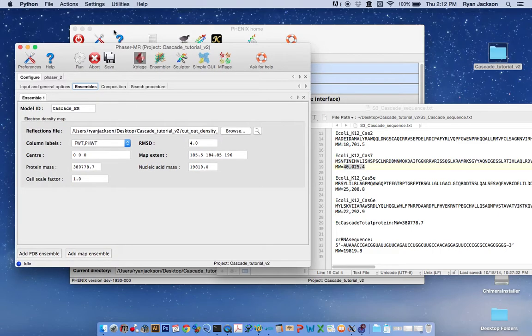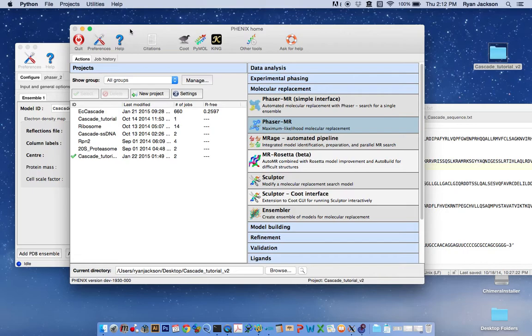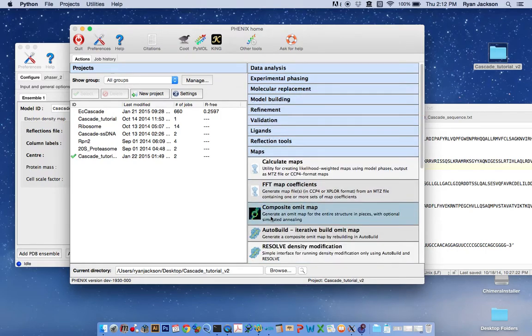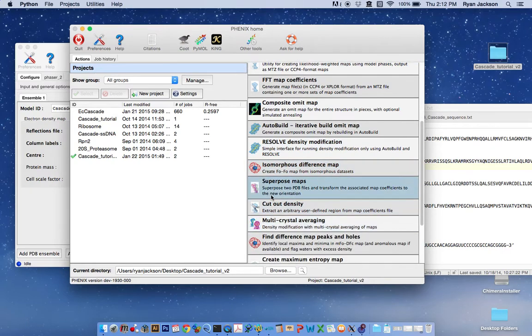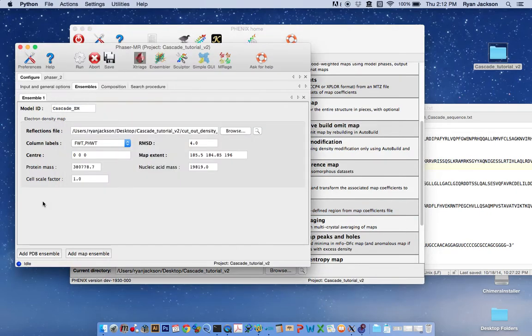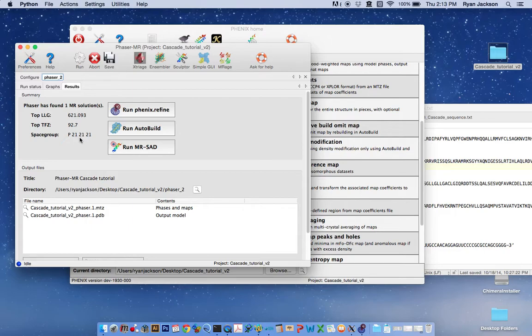Also what you could do is, if you think that there might be some hinge regions or something like that between the EM structure and your X-ray crystal structure, you could go back to the cut out density tool and use a different center and extent to cut out portions of the EM map and use them as, instead of one major ensemble, you could define more than one ensemble and search for each independently in phaser. But we have a nice solution and we're going to use this solution to locate or find NCS-related density in tutorial three.